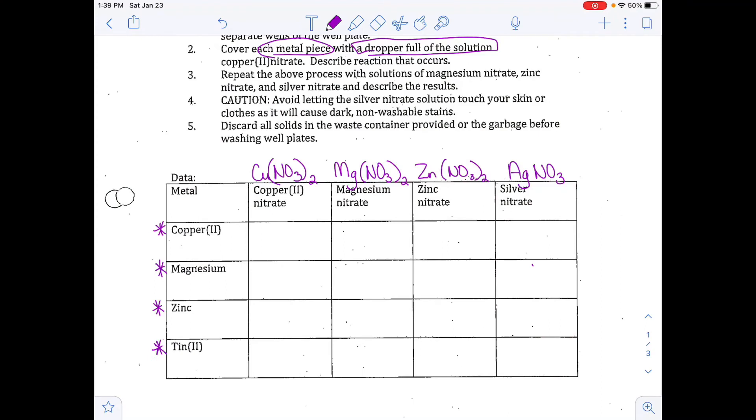The last one we're going to do is adding silver nitrate to each of the elements, and then on the video clip we will see what kind of results we get.